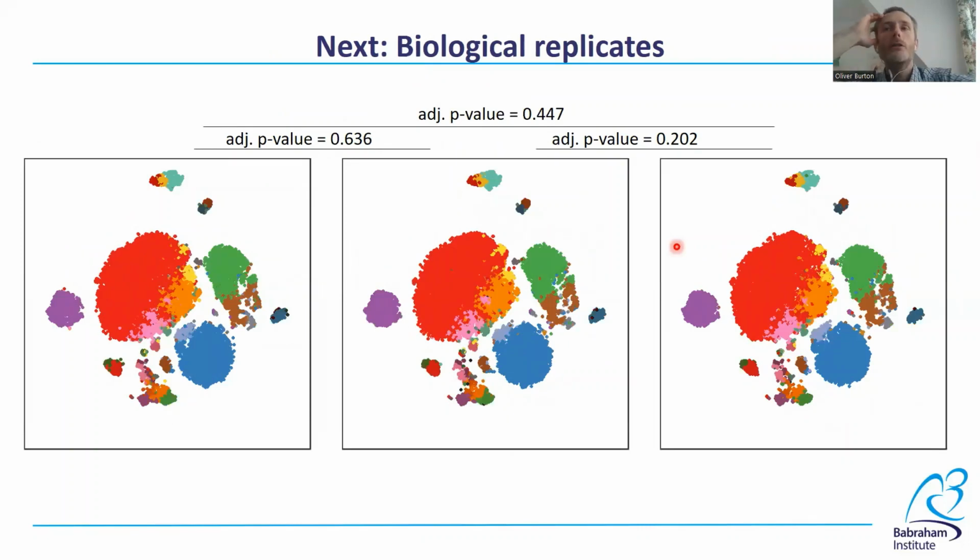In mouse research, we generally use inbred mice to eliminate variation. In this case, I'm showing you 3 tSNE plots, 1, 2, 3, taken from 3 different mice. The cross-entropy test shows them to be indistinguishable.